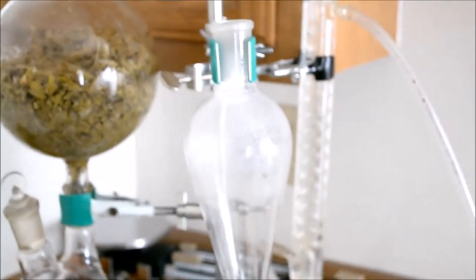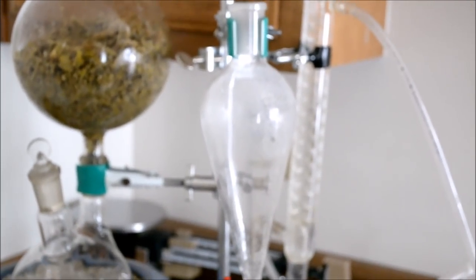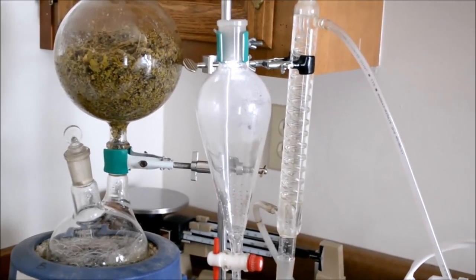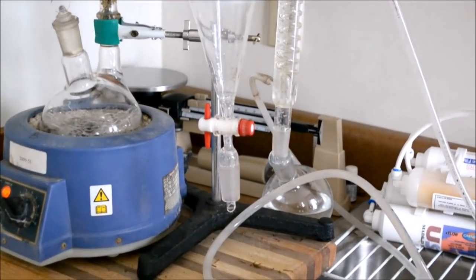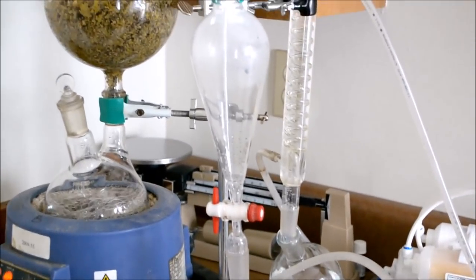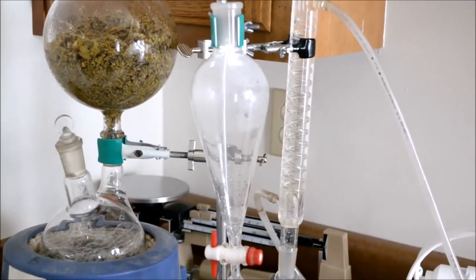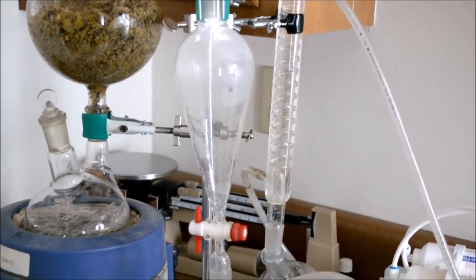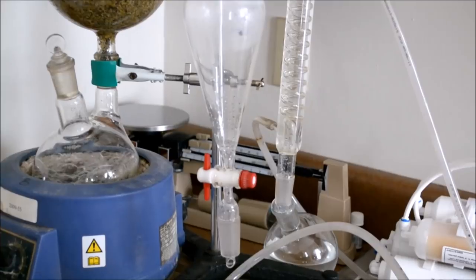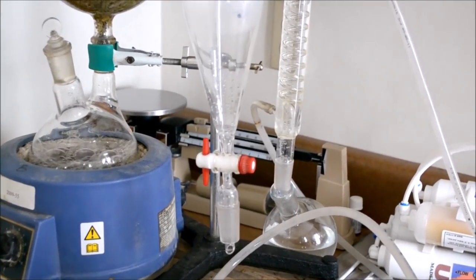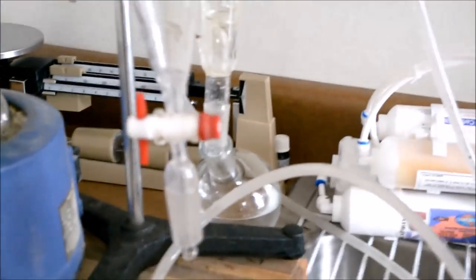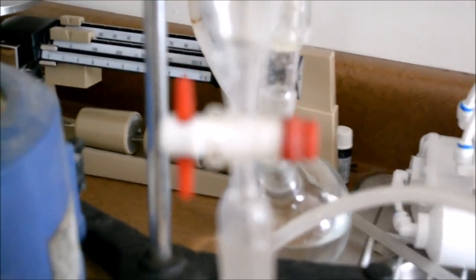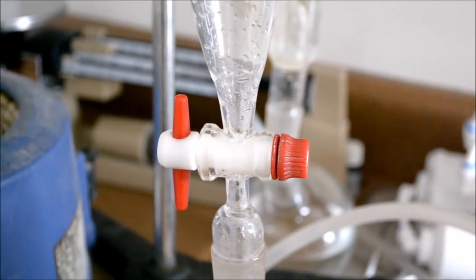And the last piece that's not always necessary but great to have, this is the separation funnel, this funky looking piece you see here, tear-shaped. And since the essential oil either sits on top or sinks below the hydrosol, this allows you to separate those two out. As you can see there, you just flip the switch and drain out the liquid until you have everything that you need.